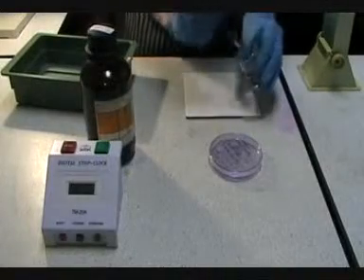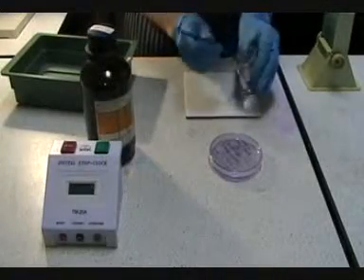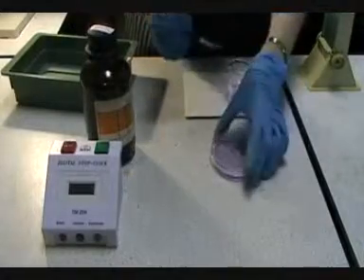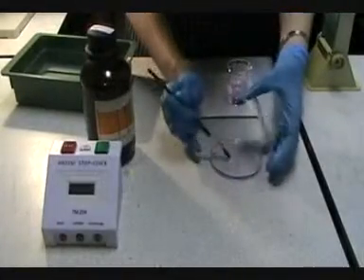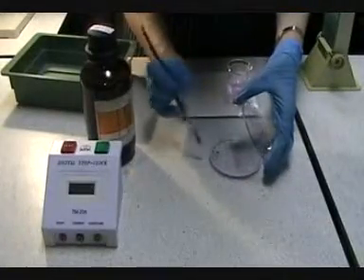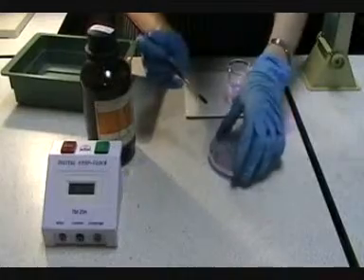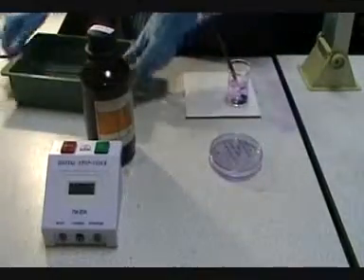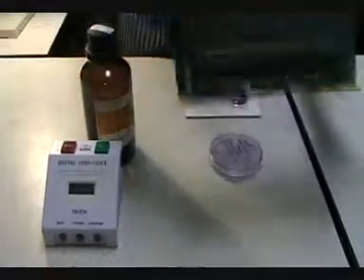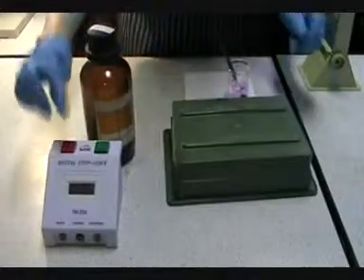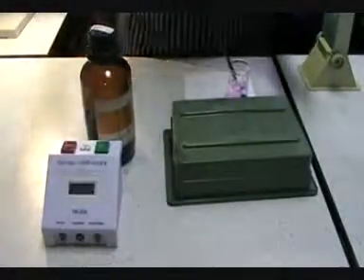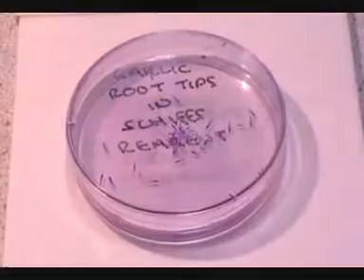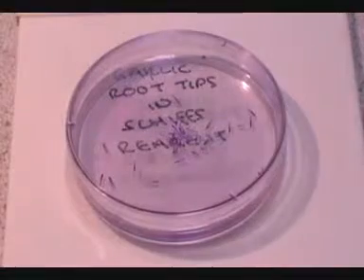The root tips are then transferred from the acid to the stain known as Schiff's reagent and kept in the dark for approximately 10 minutes to develop. The root tips will now appear a beautiful shade of magenta.